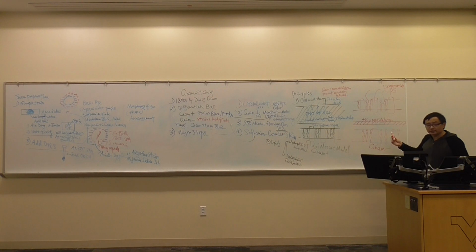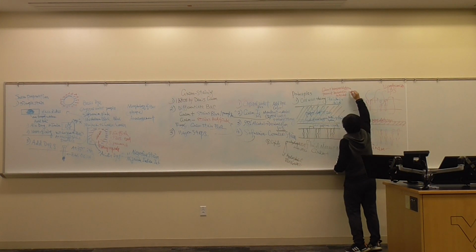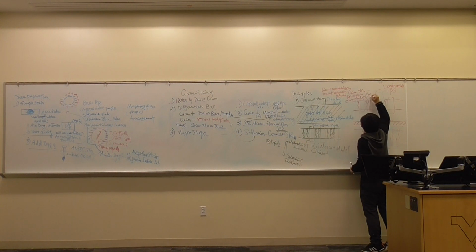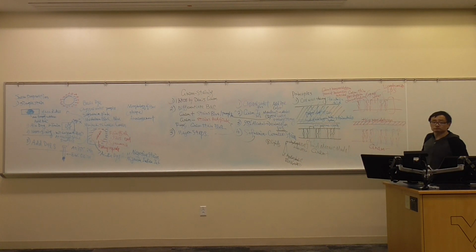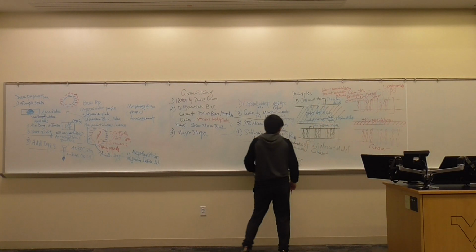However, gram-negative bacteria, because of their very thin peptidoglycan, cannot hold on to the crystal violet during the decoloration process. That's a reason. Lots of textbooks are written about that. That's called the cell wall theory.